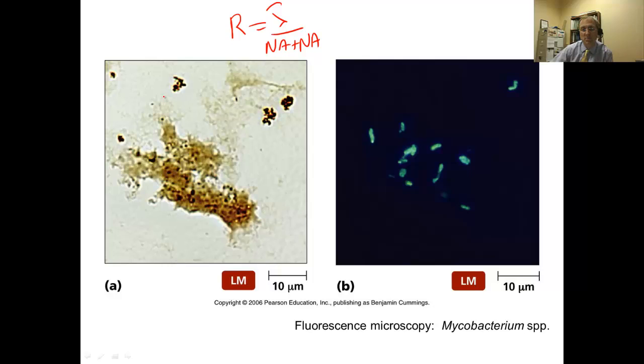Over here on the left, we see a prepared specimen. Not a lot of detail, kind of a clumpy, darkish material without really very much interesting for us to be able to see here. This has been specially treated with a chemical, and the chemical reacts with certain microorganisms that are in this big clump of material.